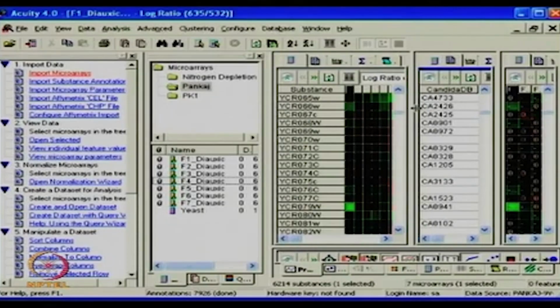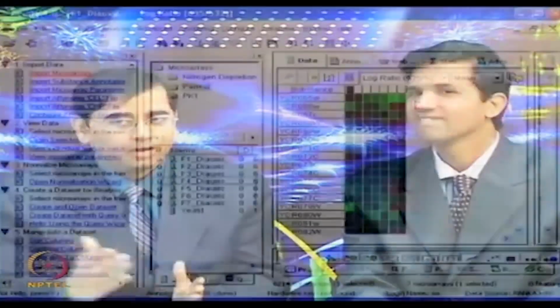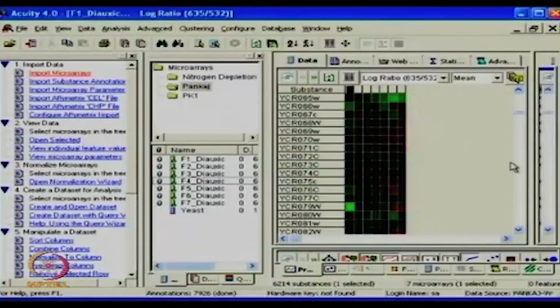Okay. So there is enough opportunity for you to play around, how you want to look and customize your view. I think these types of heat maps right away give you a feel about what type of genes across each time point have shown variation or modulation in the expression profile. Looking at the color itself, for the first one, I can easily say it's going down as we are moving towards the 20th hour.